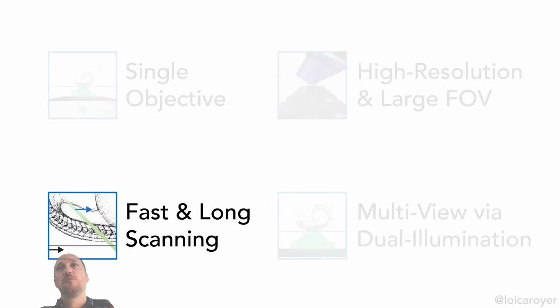So what about imaging speed? That's a very important thing, right? If you want to do live imaging, which is something we really care about in the lab for our purposes, you need to make sure that this instrument is very fast. We were facing some issues, and we found some nice solutions. So we have this approach for fast and long scanning.